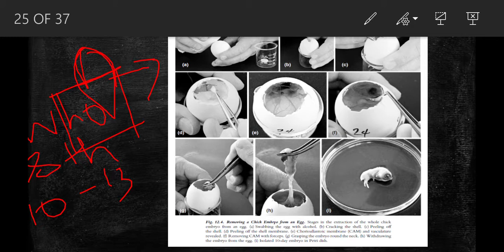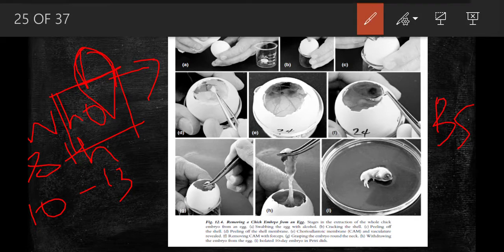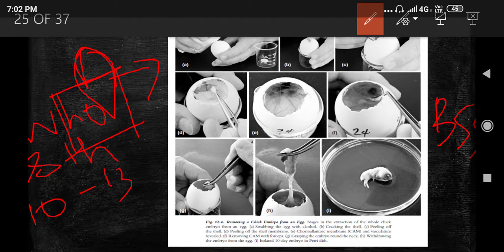After cracking open the shell, you re-sterilize the forceps by dipping it in alcohol, then burning the alcohol so the alcohol residue doesn't harm the embryo. Let it cool in BSS medium, which is balanced salt solution.